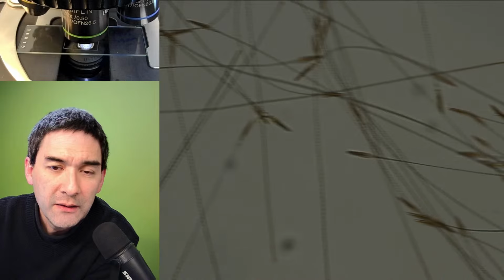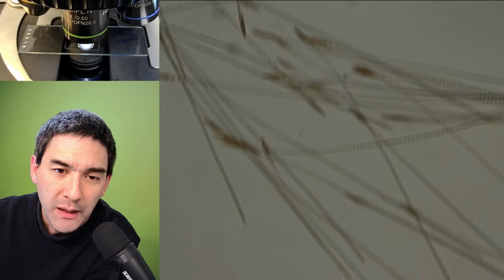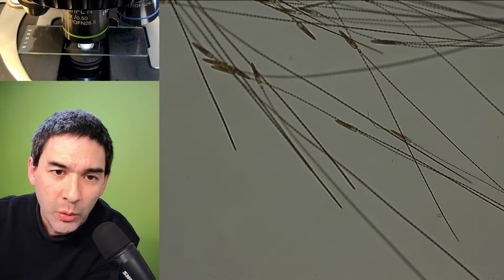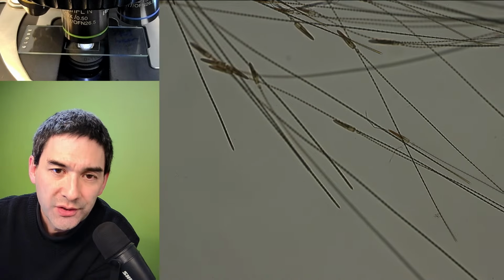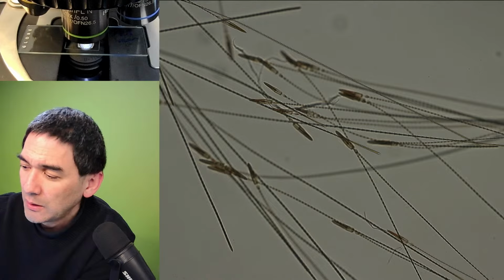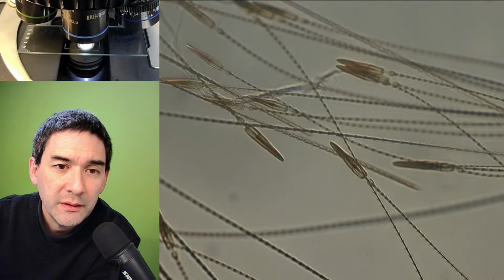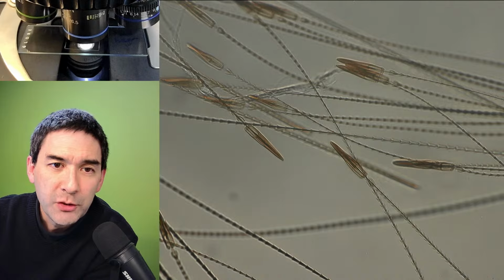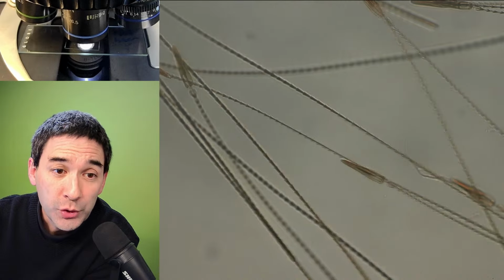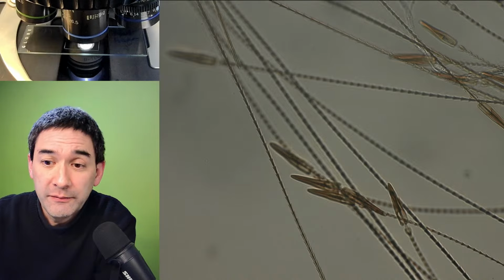When I first found them several years ago in a dust sample, I had absolutely no idea what in the world this was, until I posted a picture in a German microscopy forum, and somebody told me what they are, and that's how I was able to identify it.